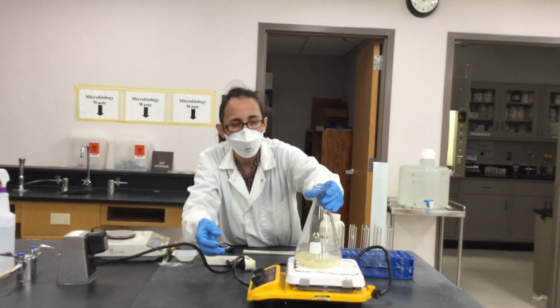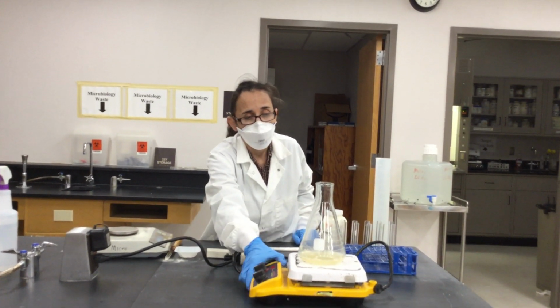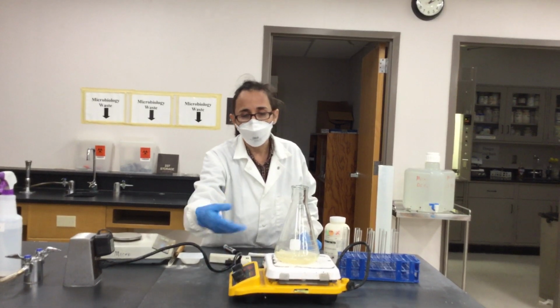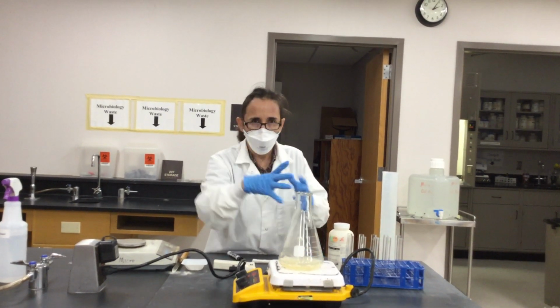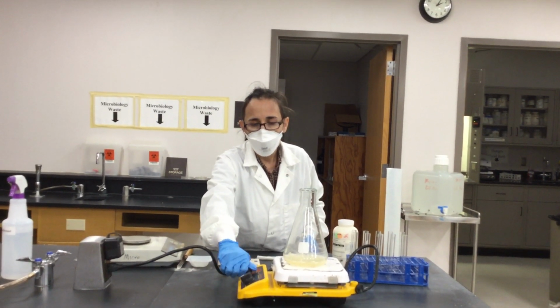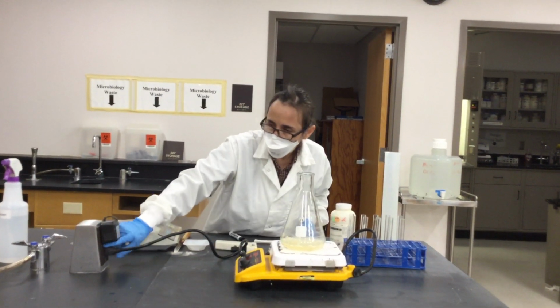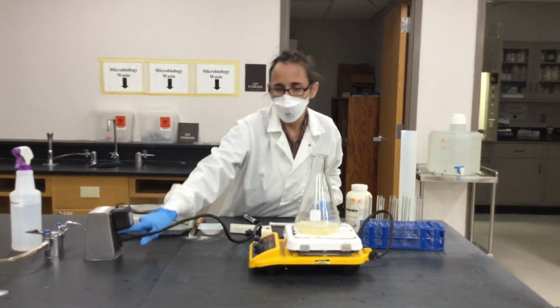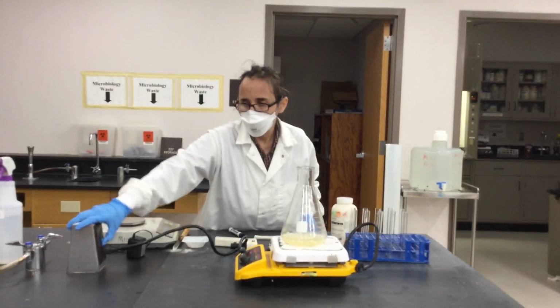So you put your stirrer in, you put in your hot plate, which has a magnet, and that magnet, once you turn it on, is going to make this media spin, to homogenize, and you put your hot plate at a high temperature so you can start melting the agar.